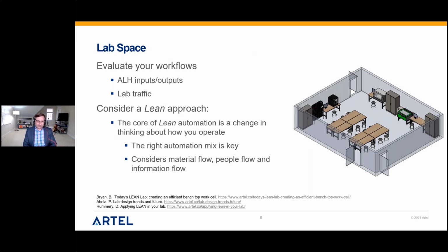The other part that we need to think about is the lab space itself, and I alluded to this earlier about the setup. But it's not just about, I have an empty bench over here, let me put it there. You really want to think about your workflow, and it's about all of the inputs and outputs for your automated liquid handler. What I mean by that is the inputs are you reaching into it and setting up your reagents, plates, and other items, loading the consumables into this system. Or maybe there are occasional transfers in and out of there if it's semi-automated.